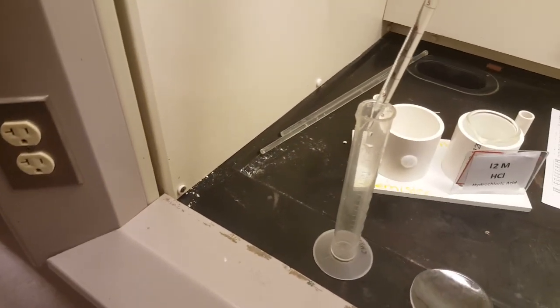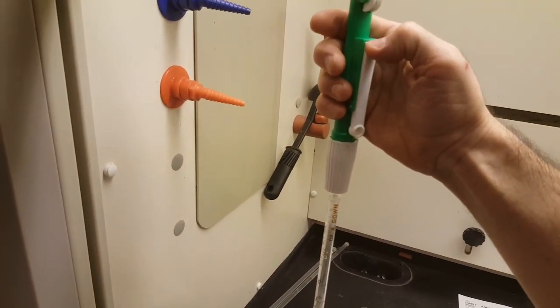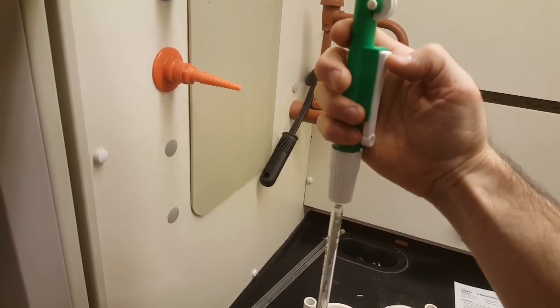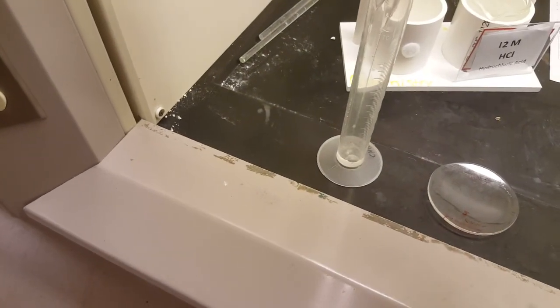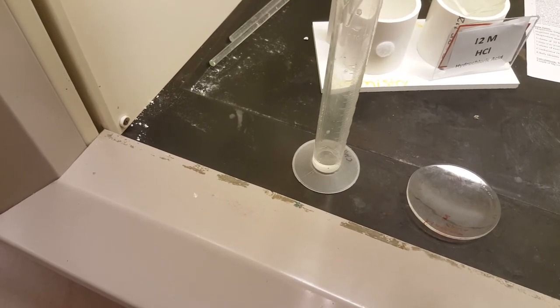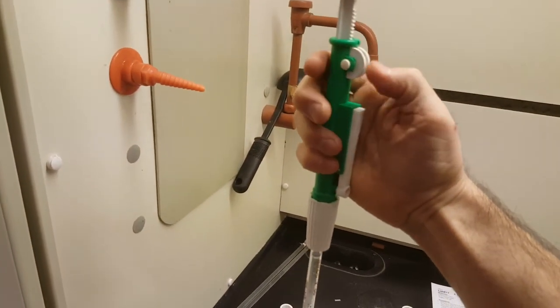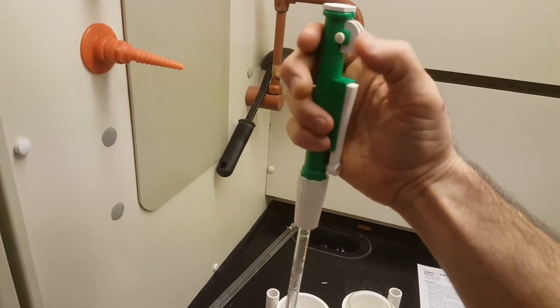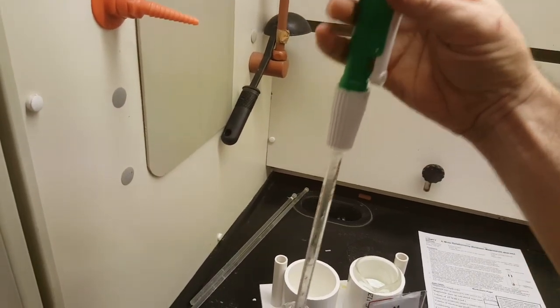Move that carefully over to your graduated cylinder. And this is where you hit the plunger, or the release button. I already used the word plunger. Hit that release button, and your 6.00 milliliters should drain into the bottom of your graduated cylinder. Okay, so your next step is to push anything else out of the pipette. Push the rest of that acid out by rolling the thumb wheel back up.